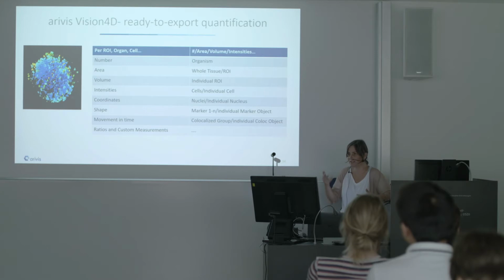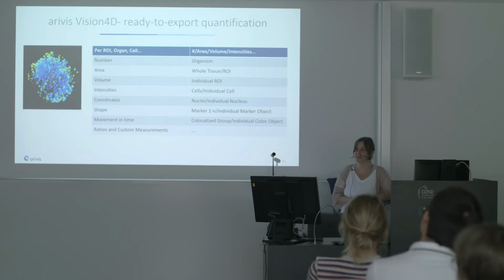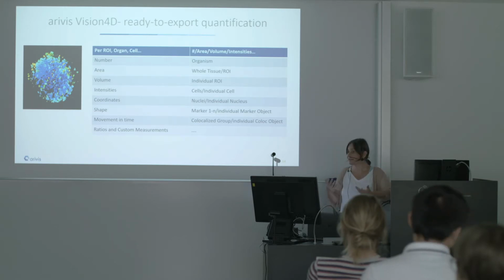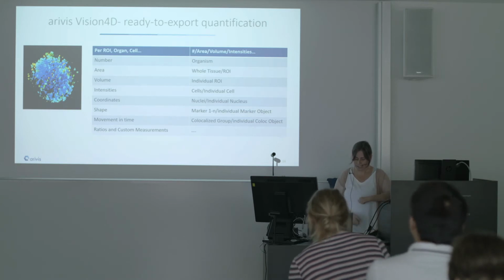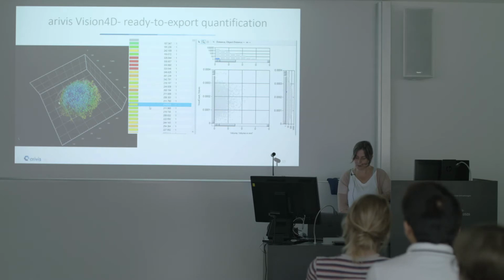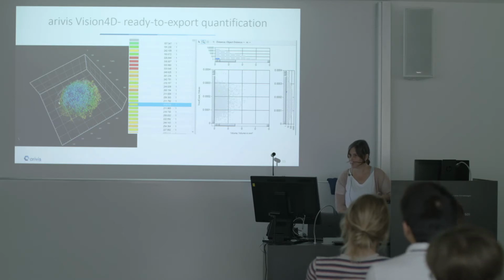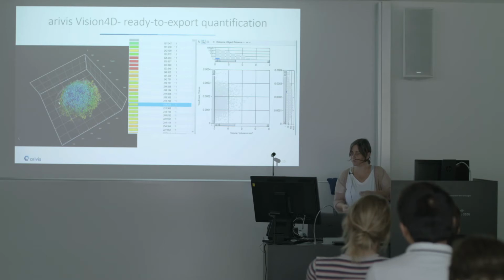But you can be more sophisticated with this tool, asking, are the red cells in the vicinity of a vessel, or where are they located in the region of interest, and so forth. So basically, you can get out single cell information and information of groups. You can relate groups of objects or groups of cells or groups of spots to each other.